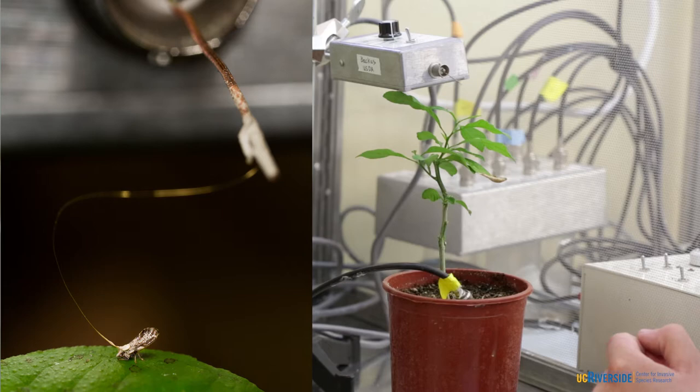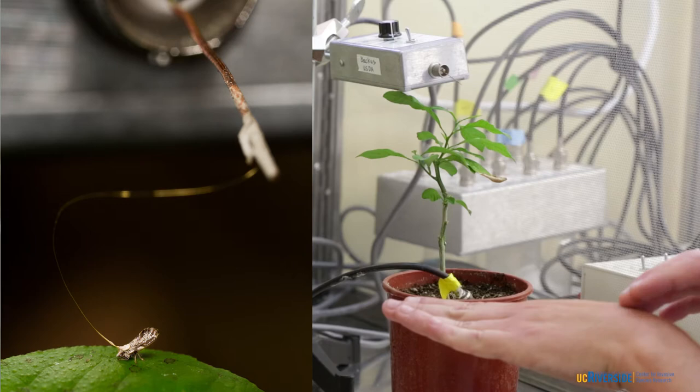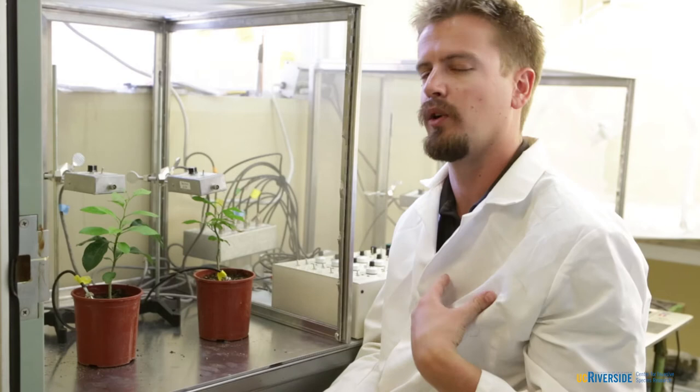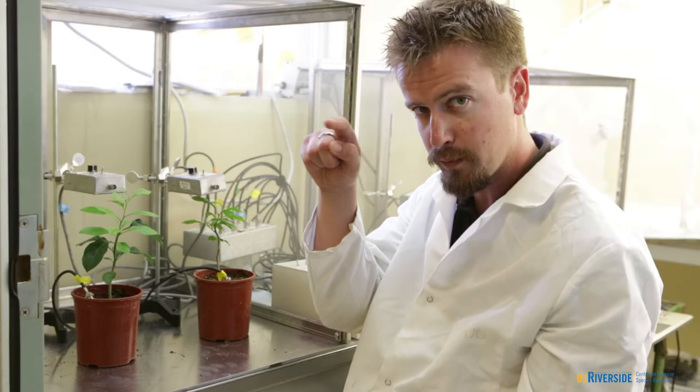This will go back into the machine, which will then send a signal to the computer. And what's going on here is that when the insect is on the leaf, crawling along, inserts its stylet, it's now completed that circuit. So it's very similar to an electrocardiogram or EKG for your heart in the hospital. You get a readout on the screen, a little rise and fall, a little boop-boop on the screen there.